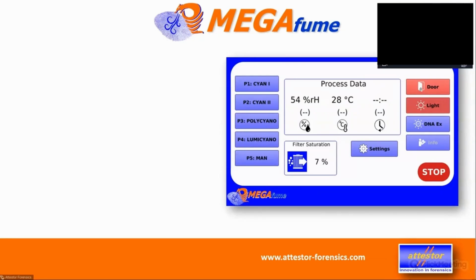I think, if I recall correctly, that's approximately what they can do. Now, very, very seldom will you actually fume 5 grams. I mean, this is way over the top. But for security reasons, they said, okay, let's make it 5 grams.